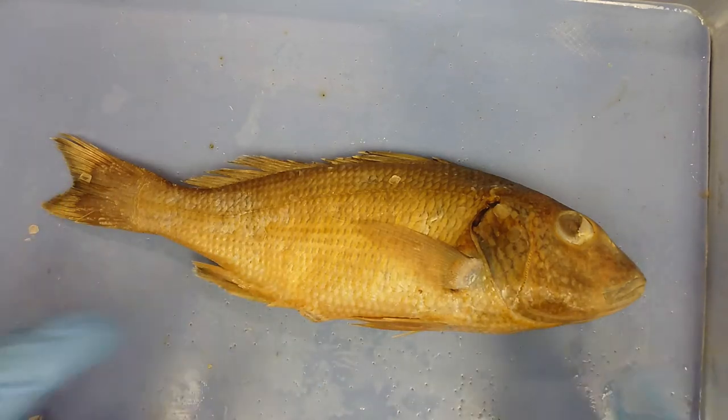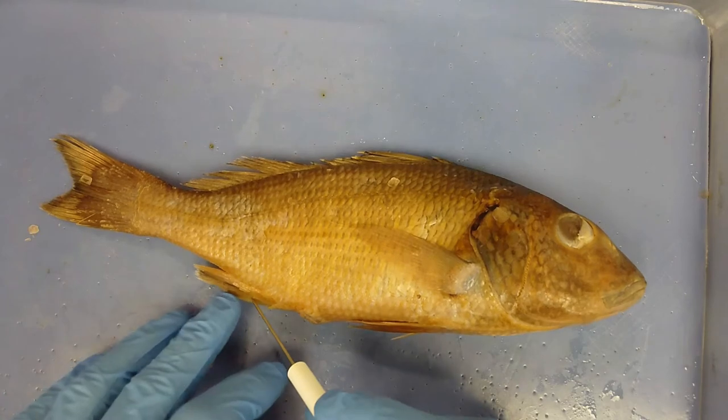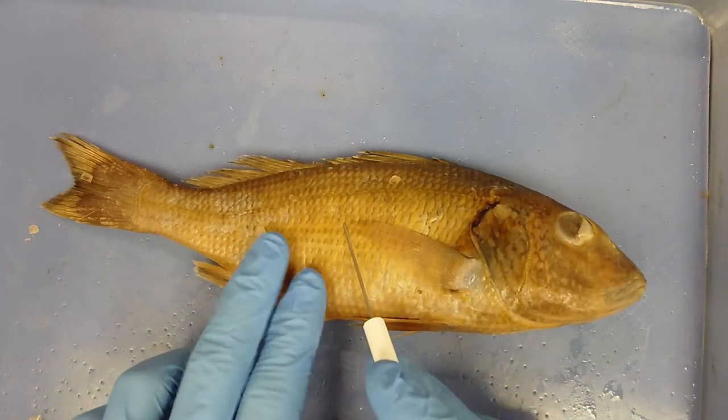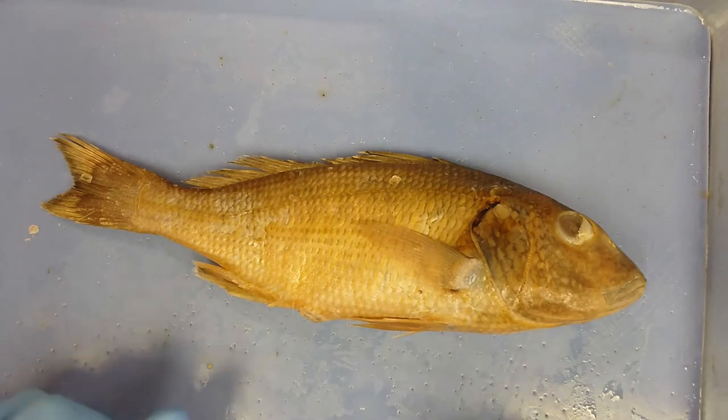So instead of having a notochord like the cephalochordates, hagfish, or some of the other primitive chordates, this organism has a true vertebral column that has replaced that notochord.